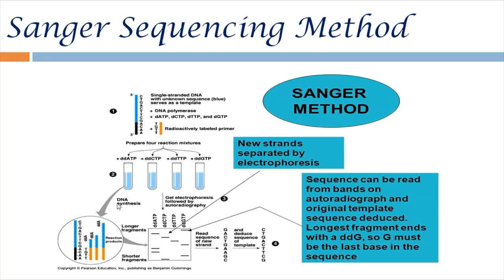All right. So coming to the main topic, in order to understand next generation sequencing procedures, it is very important for you to know the Sanger sequencing method. Most of you might know, but I'll just go through that once again. What do we do in a Sanger sequencing procedure? You have a piece of DNA that has to be sequenced, and we attach a radiolabeled primer, which could bind here. And then what else do we do? We put in all the dNTPs, and then we also add, in four different tubes, four dideoxynucleotides. By controlling the ratio of these dNTPs and ddNTPs, it's possible to allow the strand to terminate in such a way that at every base there are some strands that terminate, right?